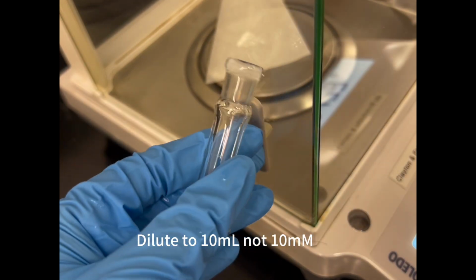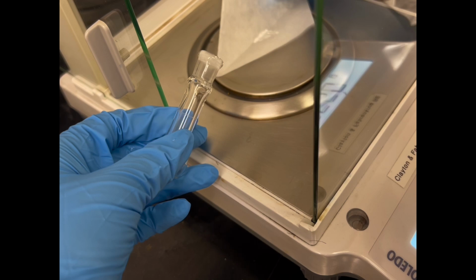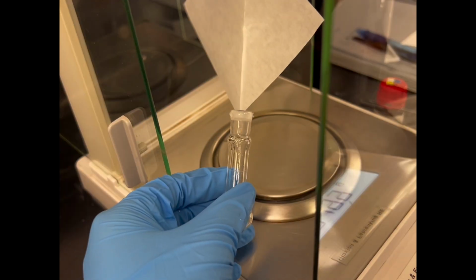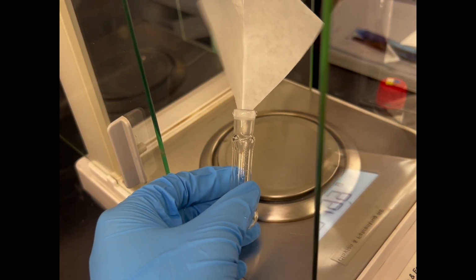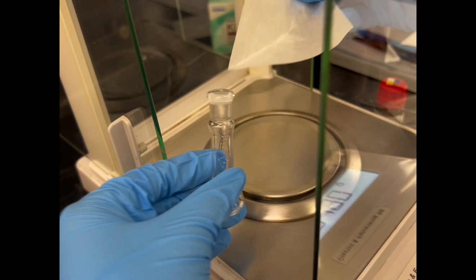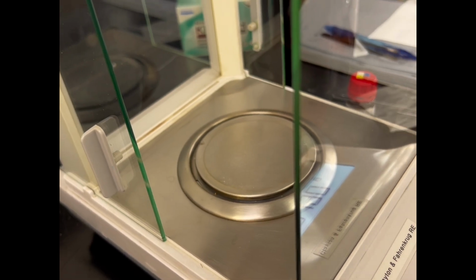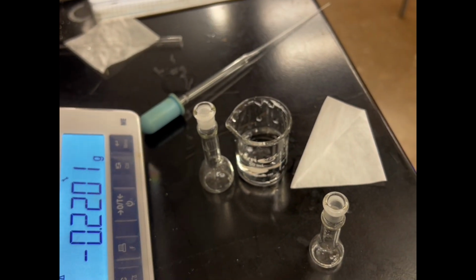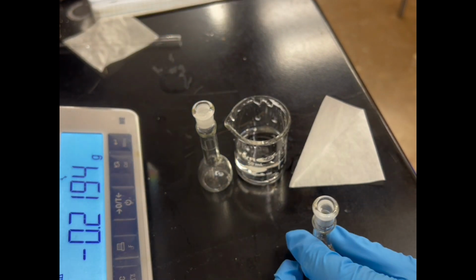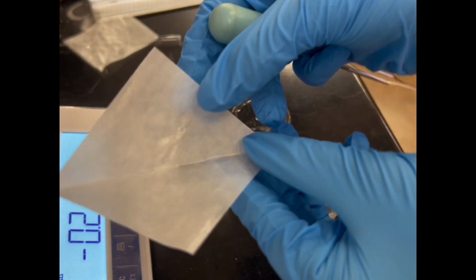Then we could have the 25 micromolar standard PFAS solution. This step is also very similar to the previous steps, that we pour it into the flask and rinse the rest of it on the weighing paper with the solvent. The solvent we use here is pure water.